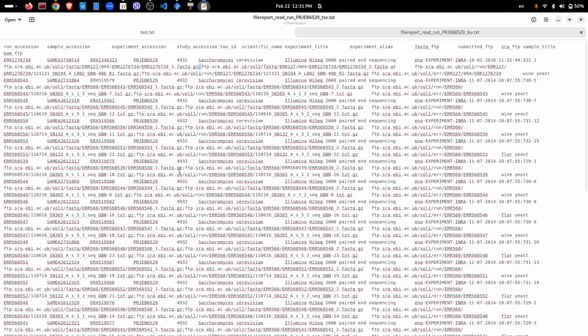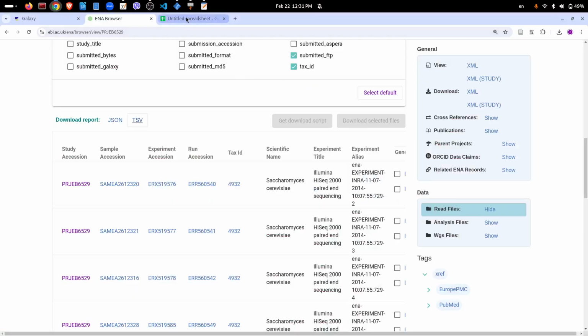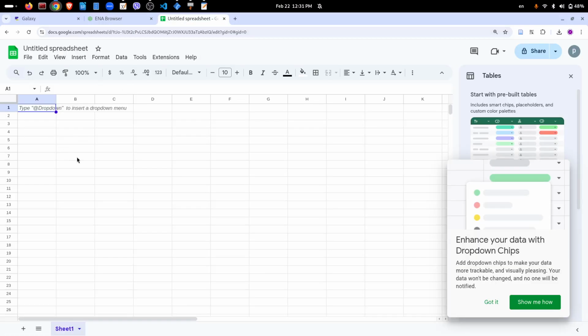Now what we will do is open this in an Excel file. I will use Google Sheets for that, and then I will separate this URL into two URLs, this one and this one, and then I will make them proper URLs by adding ftp:// in front of each link, because here this is omitted, as we see. So I select all, Ctrl A, I copy it, I go to Google Sheets and I paste it.